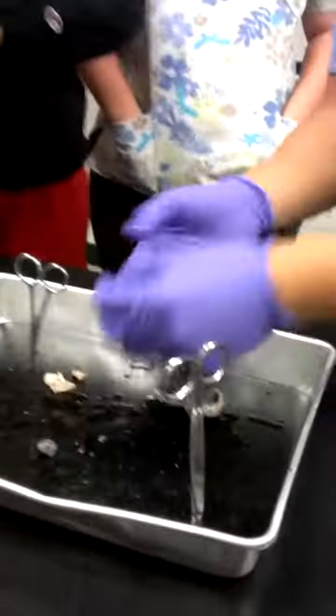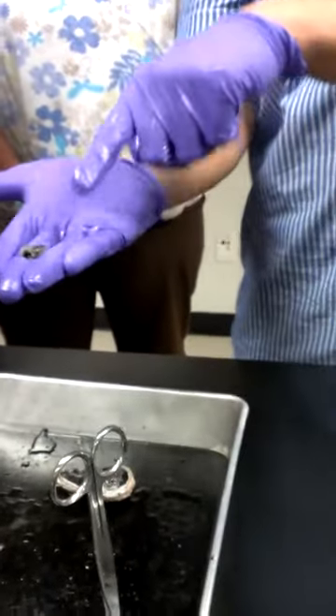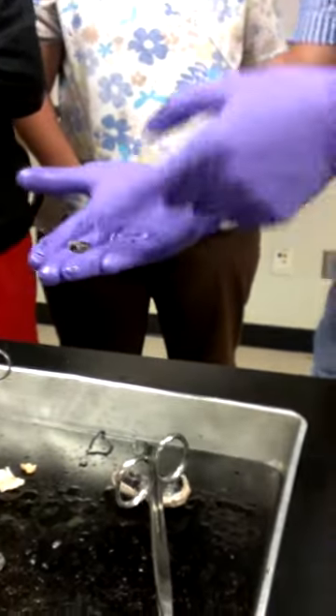All this jelly stuff — sometimes you might have a bigger ball of jelly. That's called the vitreous humor. That's the jelly substance in the posterior part of the eye that basically regulates the pressure of your eyeball, and it also helps deflect the light.